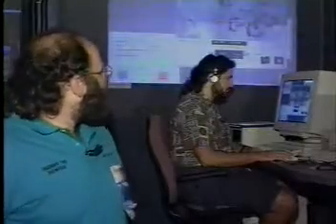With the assistance of the operator in San Diego, we will capture a stereo pair and have it transmitted back here to the show floor. We will use the voice teleconferencing tool to communicate with the microscope operator and isolate the object of interest, and then using a link command in the software, we can update both displays to show exactly what we're going to be capturing.